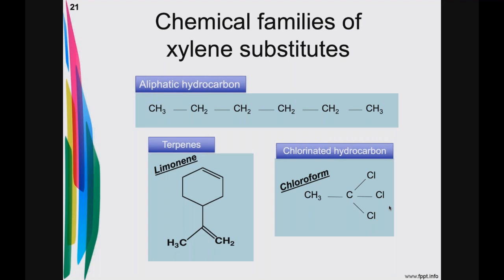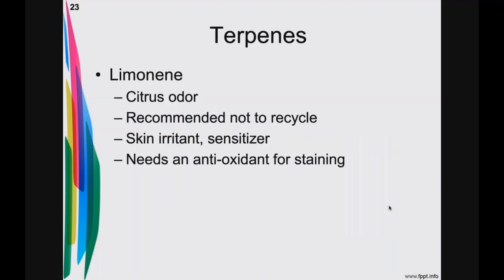Remember I showed you that picture? Go back here. Here's the limonene. I showed you those double bonds there. Shortly after limonene came out, people were realizing after they were cover slipping, they'd go take a look, and definitely days later, they'd go pull the slide, and their eosin was gone. Because the eosin dye molecule reacted with that free-ended double bond there. So it had a problem.